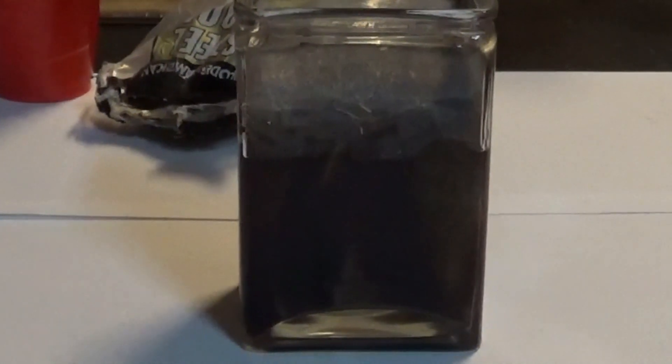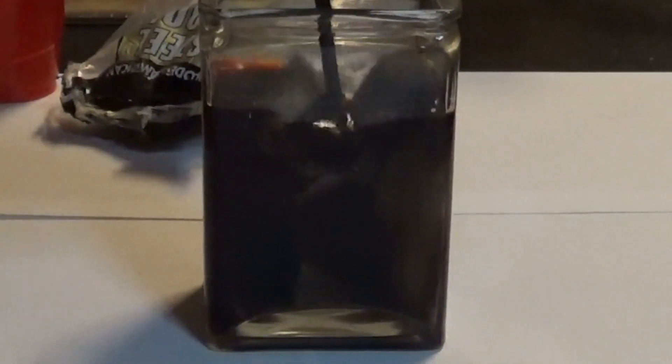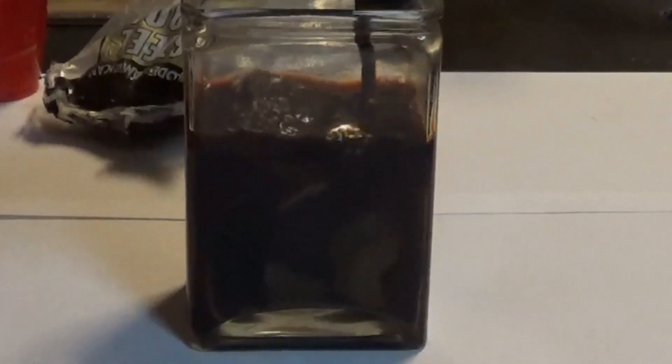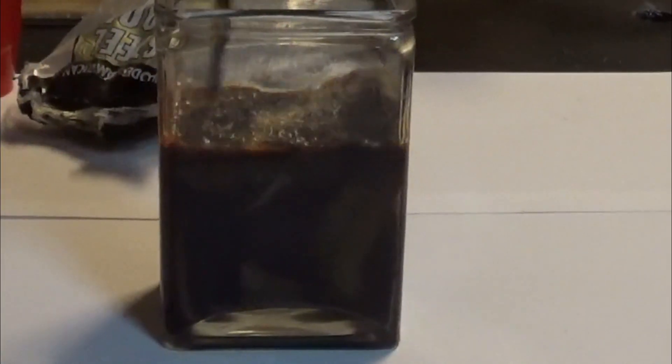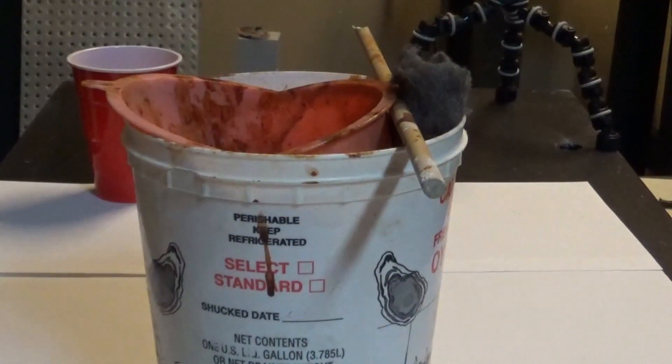Let's stir it around. Look at how dark that is already — it's only been a few seconds. I'm going to let that sit for about 24 hours. Now I have another batch that I've already been letting sit.